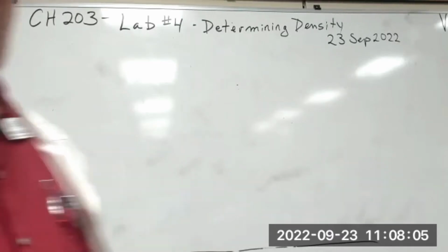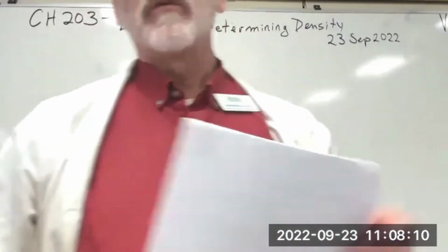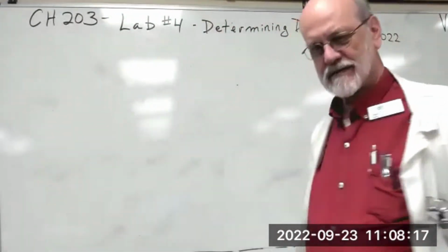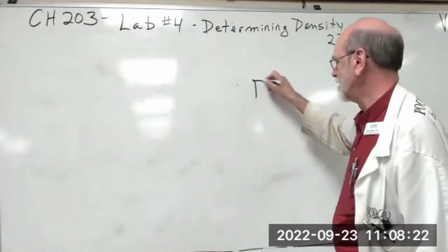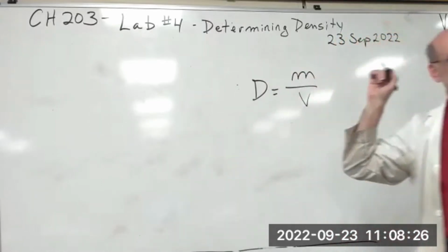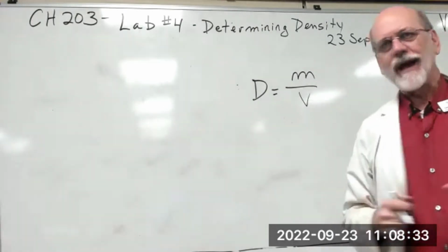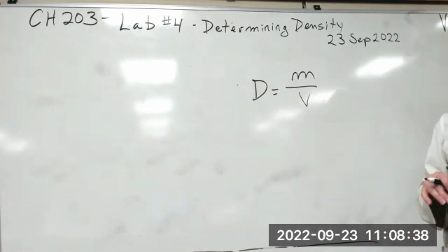Today's lab, very, very simple. We're focused on density. Remember the formula for density? Right? That simple. Mass divided by volume. Now, how you get those values may take some creative thinking.